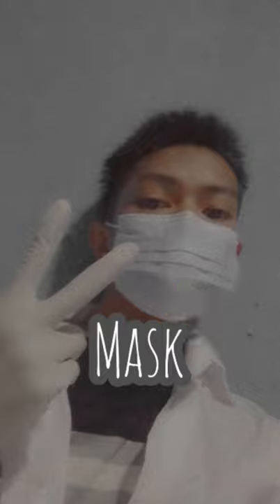Before doing such an operation, you must wear surgical gloves, surgical mask, and lab gown. So now that you are ready, let's begin.